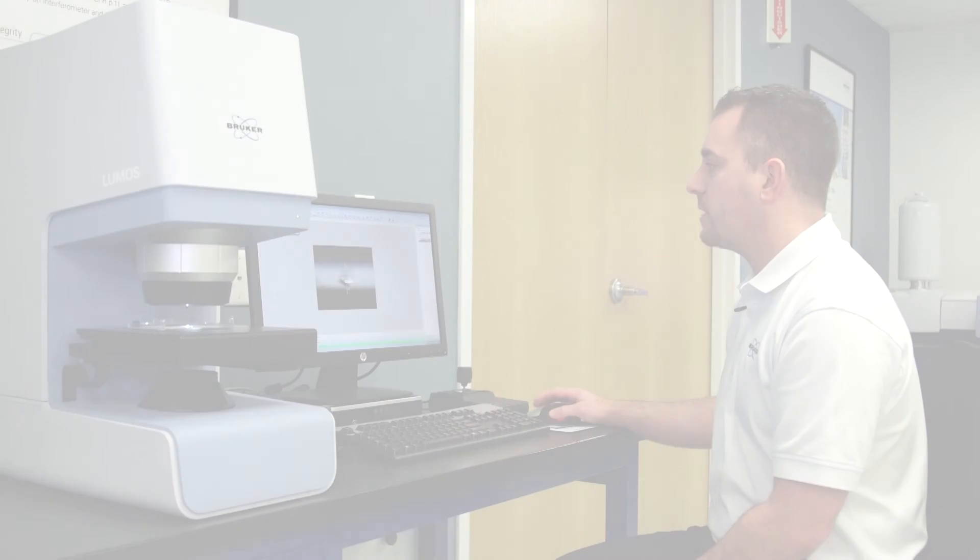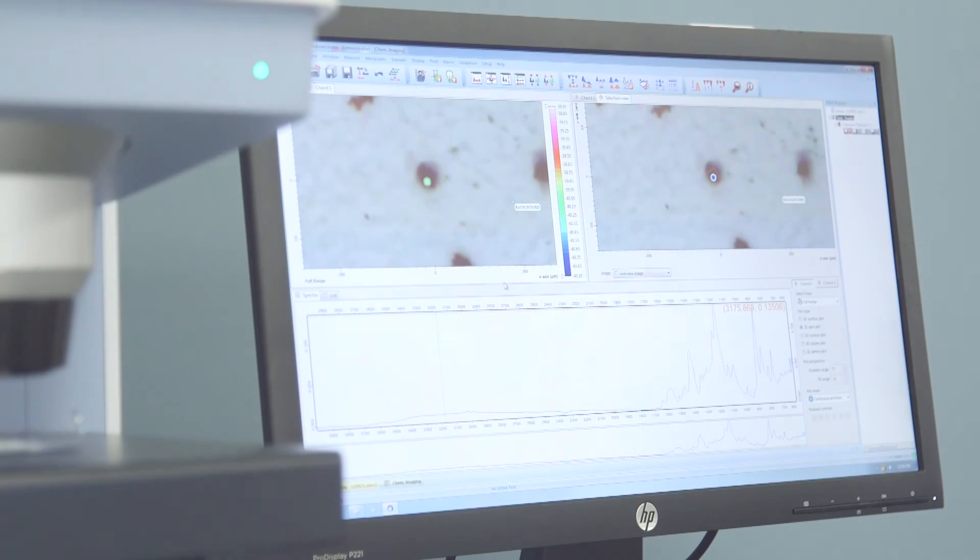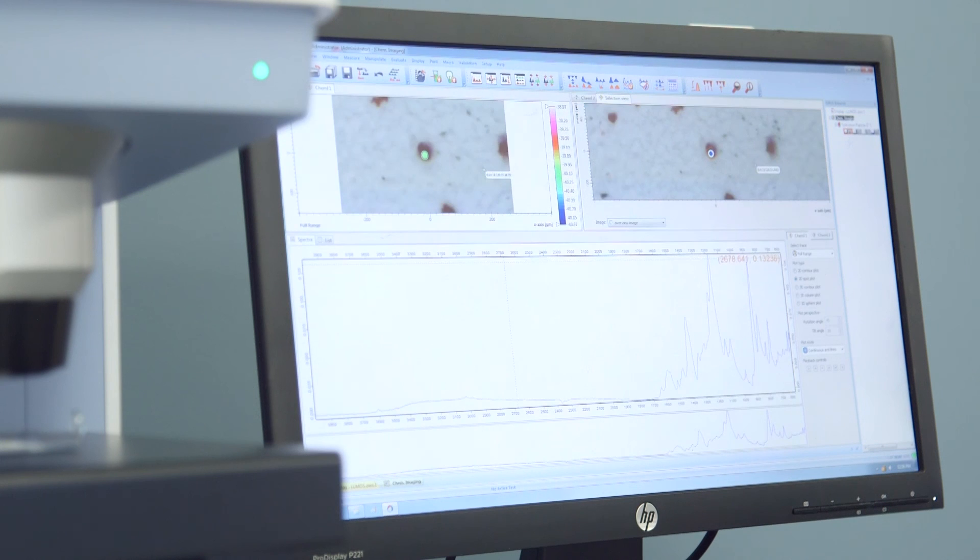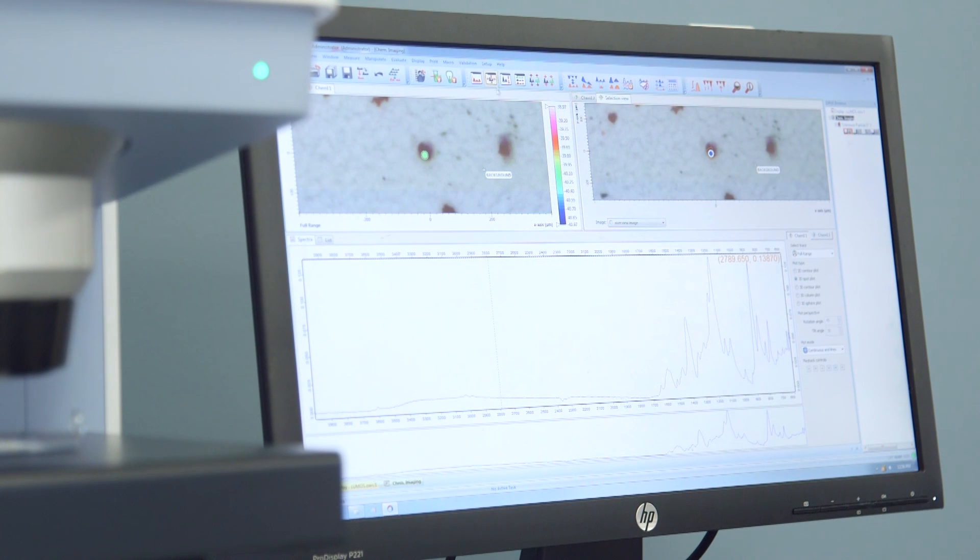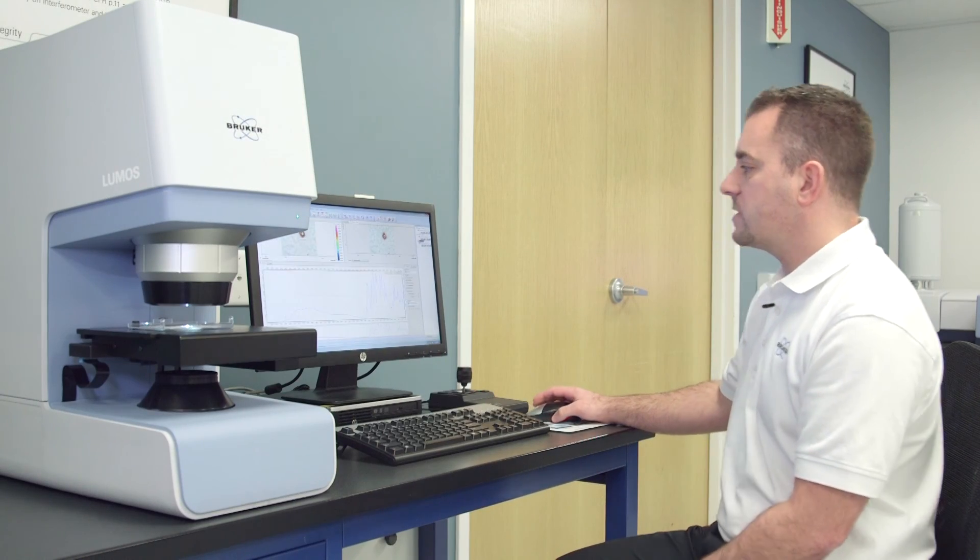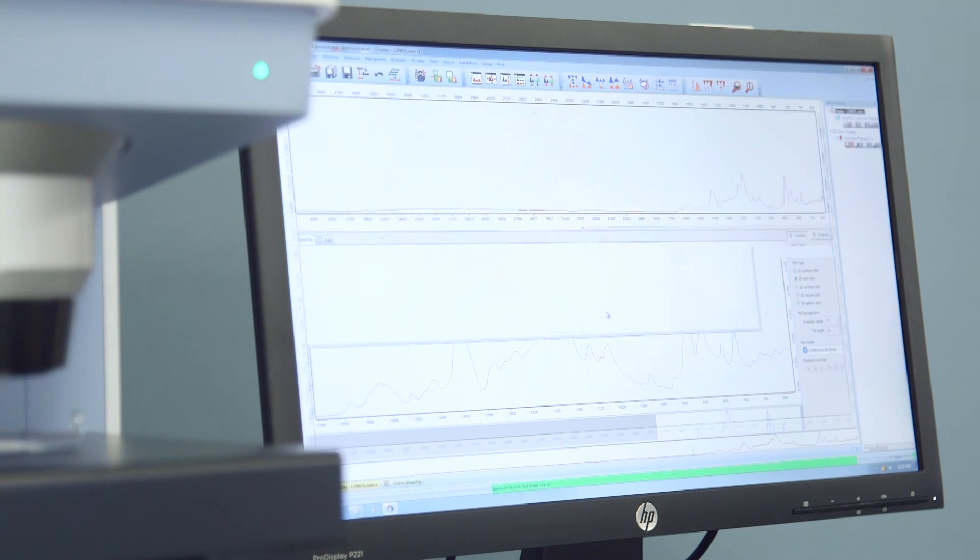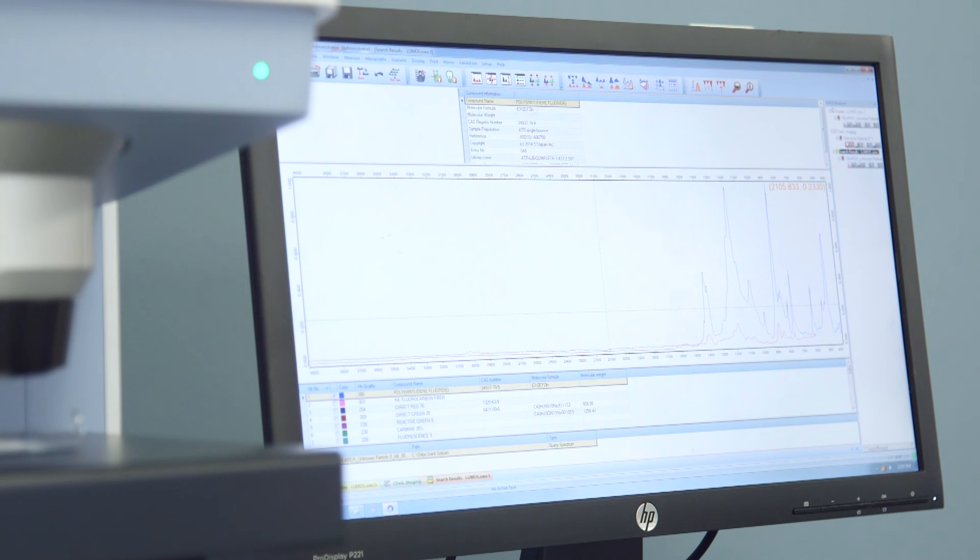So now the analysis is complete. Go ahead and see in our chemical imaging window our visual picture. So up here we can see our visual image along with our overview image. And then down here we see a nice high signal to noise spectra. Now from here I can right click and extract the spectra. I can search the spectra in a library. And I get a nice result.